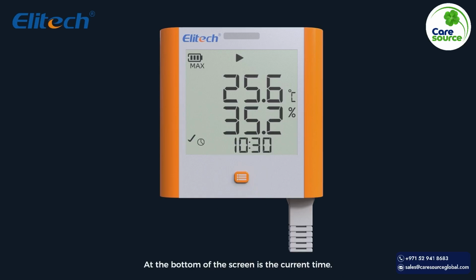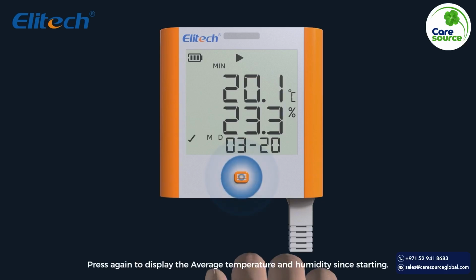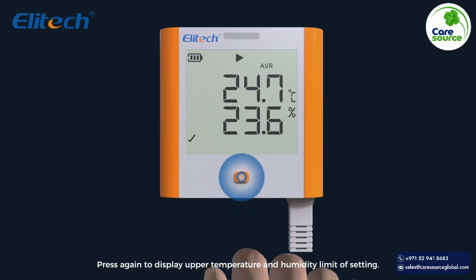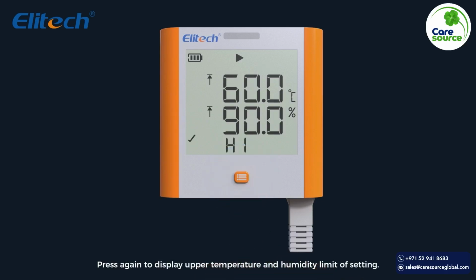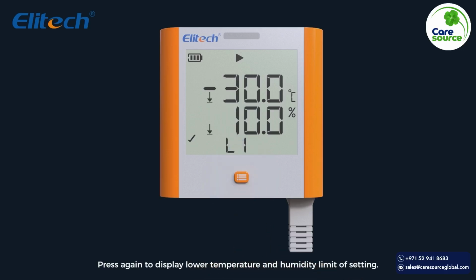At the bottom of the screen is the current time. Press the button again. At the top of the screen is the minimum temperature and humidity since starting. At the bottom of the screen is the month and day. Press again to display the average temperature and humidity since starting. Press again to display the upper temperature and humidity limit of the setting. Press again to display the lower limit.